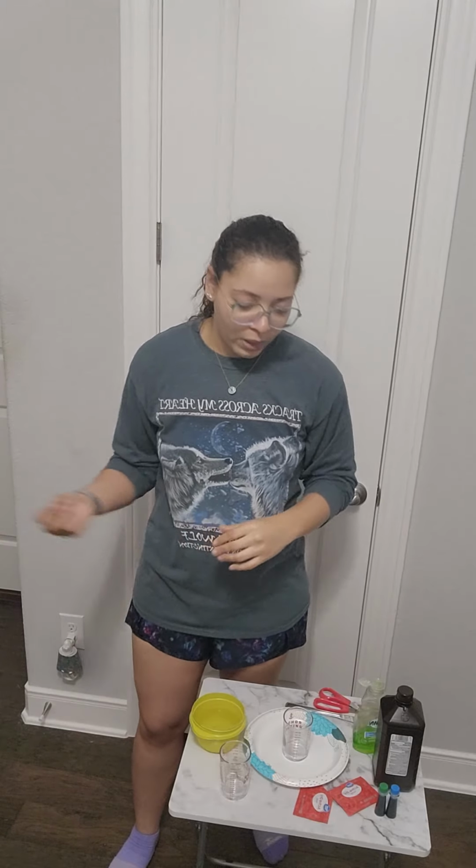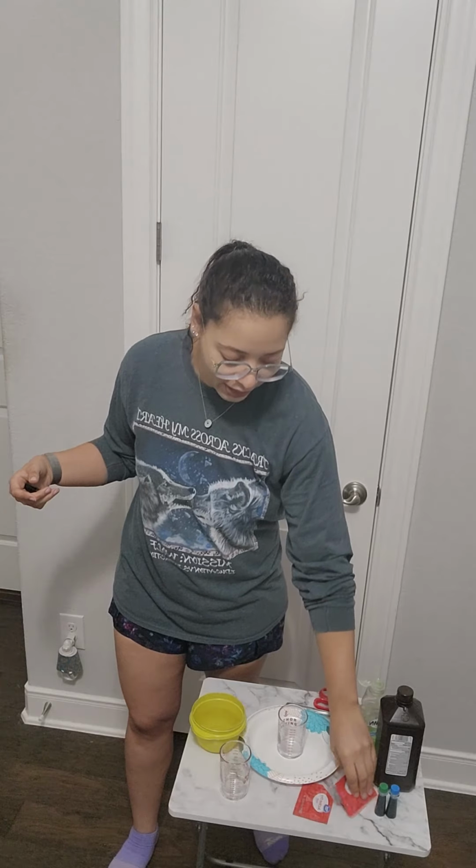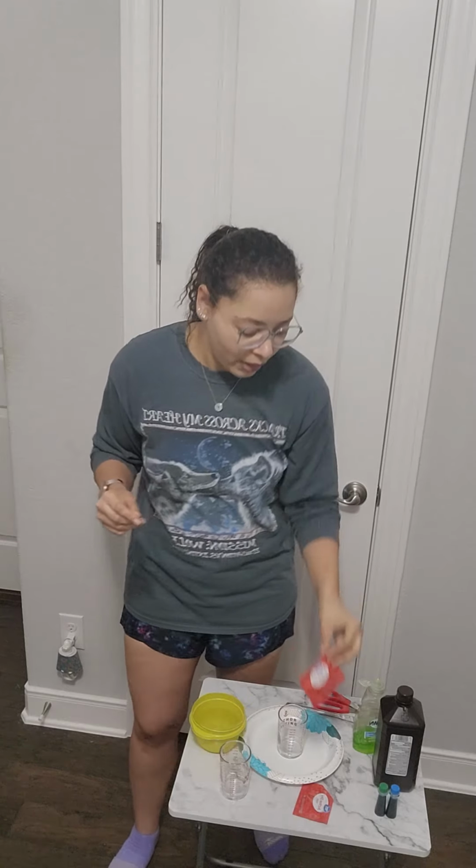So what we will be doing today with the dry yeast, and you could also use potassium iodide, is we are going to use yeast as a catalyst to help speed up this reaction. And since it is speeding up this reaction process, it is creating a more exothermic reaction.